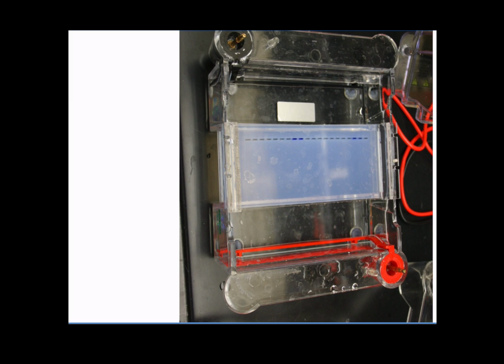And what we do is we subject these tanks that are filled up with liquid to an electrical current, such that on one end of that tank, there's going to be the negative pole, and on the other end, there will be the positive. I didn't choose the location of these two randomly. Notice that DNA, being negative, is on the same side as the negative, because what we'll want is that DNA to move or migrate towards the positive.